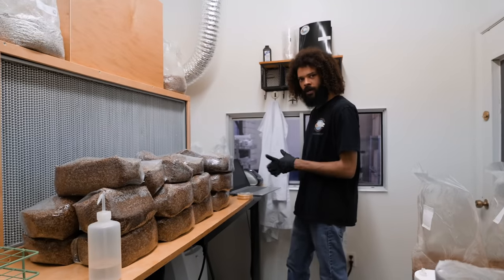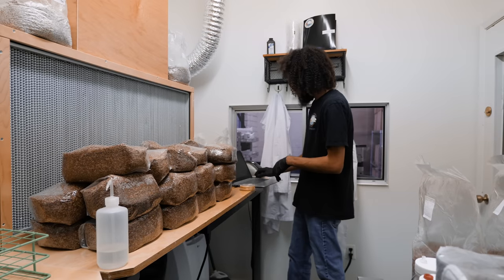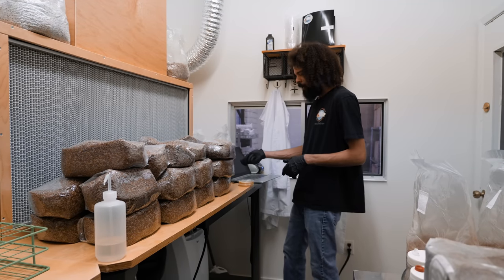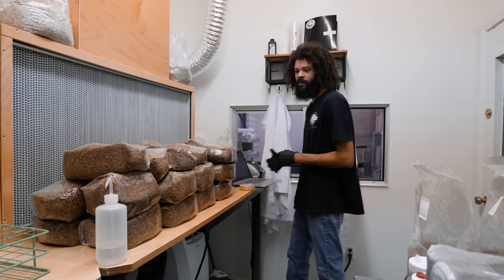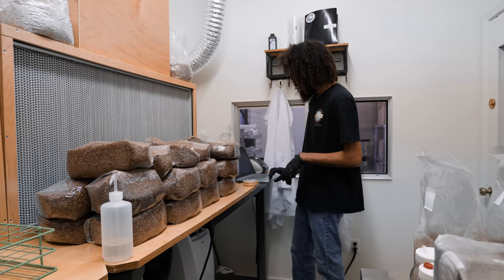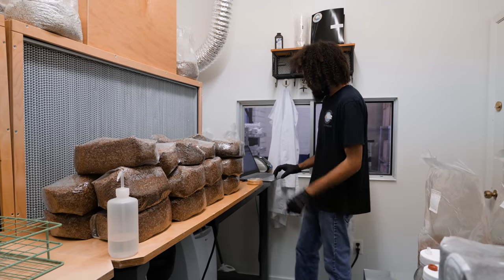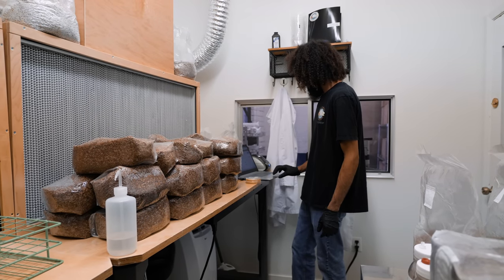I usually like to pre-print my labels for the day and just have strips of them that I can slap on bags. I found that it took a lot of time using markers — you've got to pick up the marker, open it, write on the bag, close the cap, put it down. That gets repetitive after doing hundreds of bags a day. So I just print out a bunch of labels, keep them next to me, and just slap them on bags — just trying to save time.